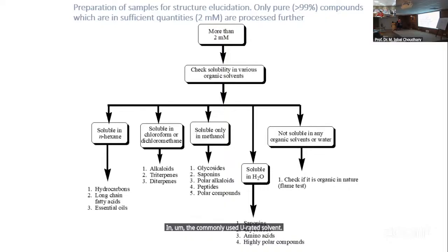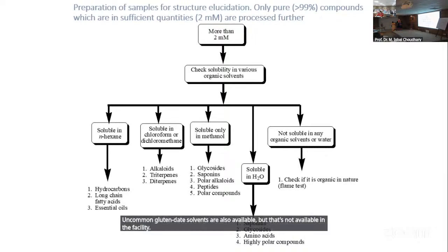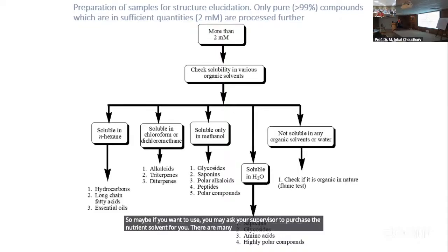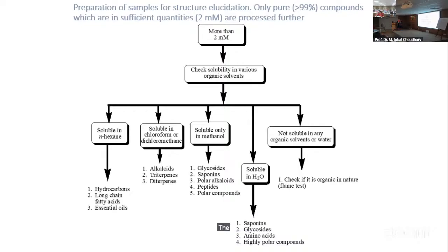Right? And there are many other uncommon deuterated solvents also available, but they are not available in the facility. So if you want to use one, you may ask your supervisor to purchase the deuterated solvent for you. There are many types of deuterated solvents available, but we usually have the common ones, in which most of the organic compounds are easily soluble.